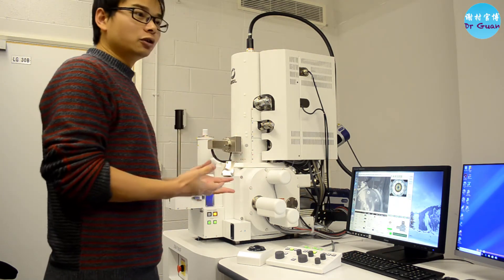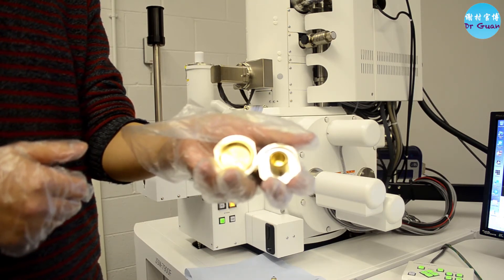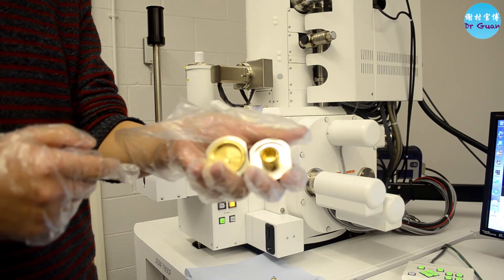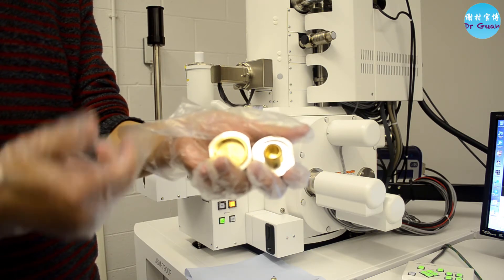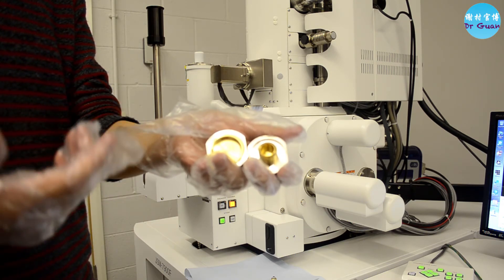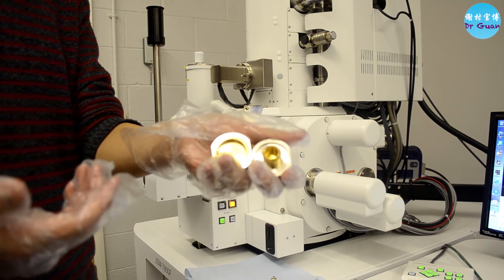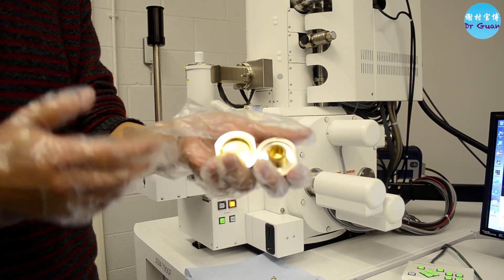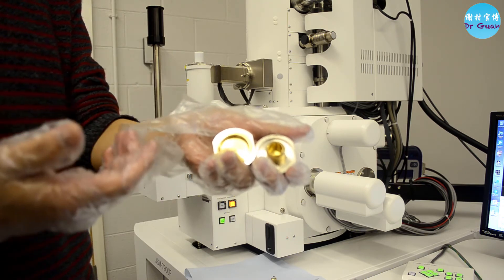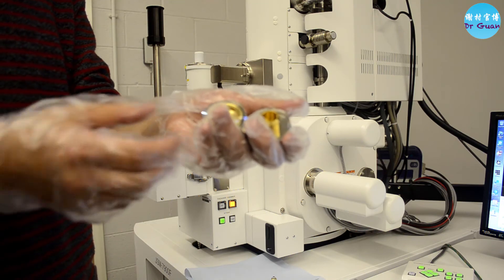Now I'm going to show you how to load the specimen into the SEM chamber. These are two standard specimen holders from JEOL. We normally use these two: the small one has a diameter of only 12.5 millimeters, and the big one has a diameter of 32 millimeters. For metal samples — for example if you want to scan a mechanical material — just use the metal piece with no large mounts or cold-mounting materials. Importantly, whenever you handle the specimen holder or your samples, please remember to wear gloves, otherwise you will contaminate the specimen holder, sample, and ultimately the chamber.